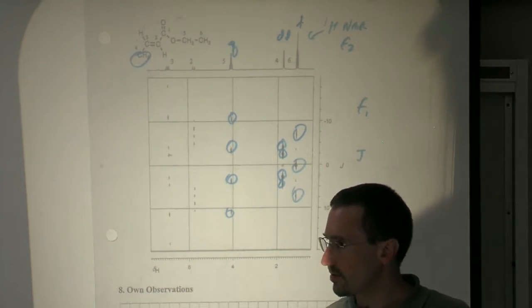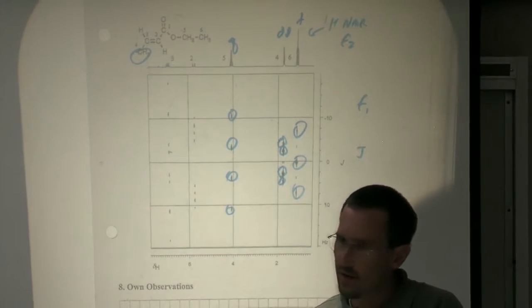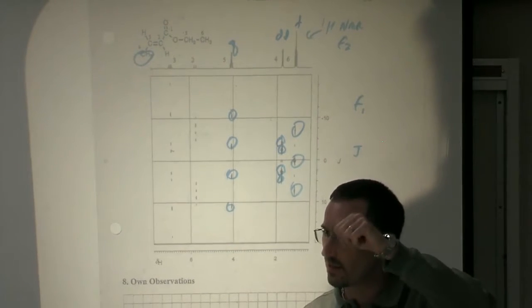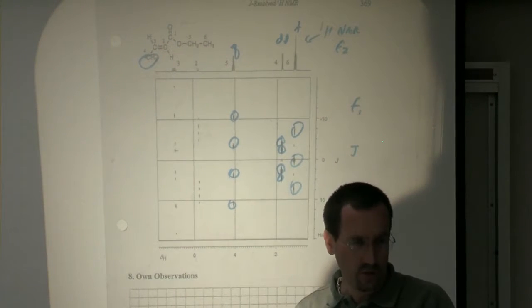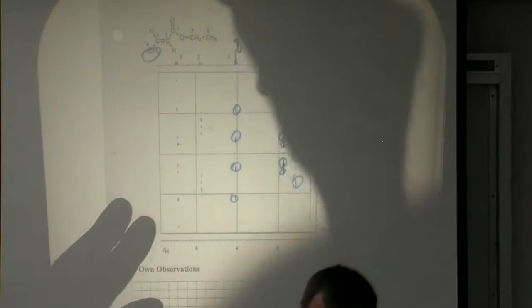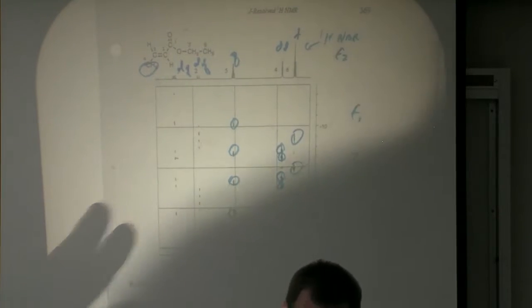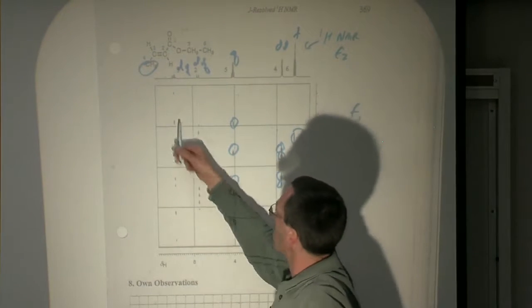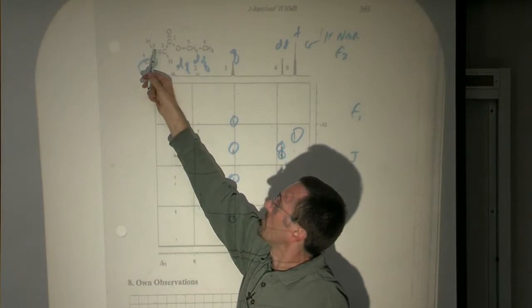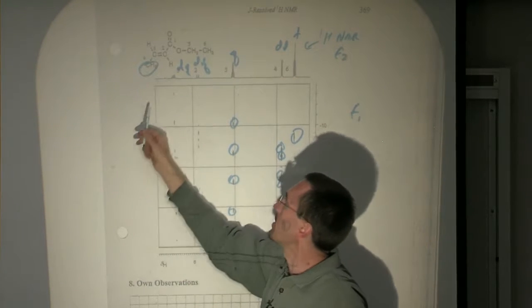Remember, we said J values can be very useful for dealing with stereochemistry. And so if you want to figure out, okay, do I have a 10 Hertz coupling constant? Do I have an axial-axial interaction? Do I have a 3 Hertz coupling constant? This can come out. Here you have a doublet of quartets and another doublet of quartets. Of course, this one is associated with this proton, where you've got a big, big trans coupling and then about a 7 Hertz coupling to the methyl.